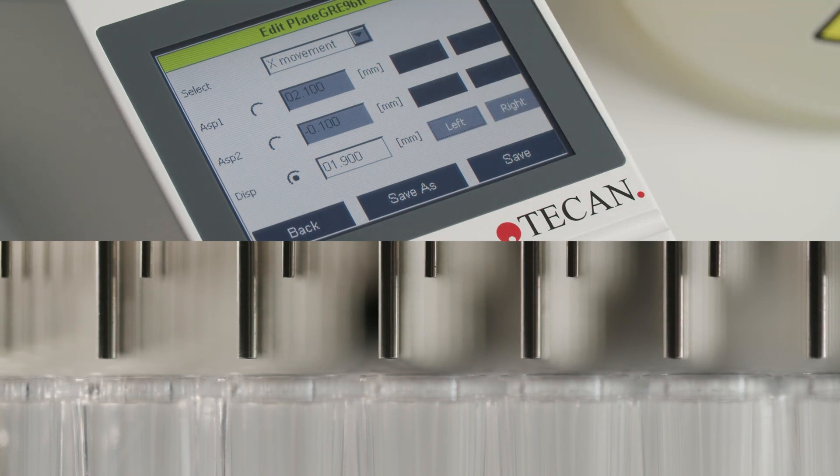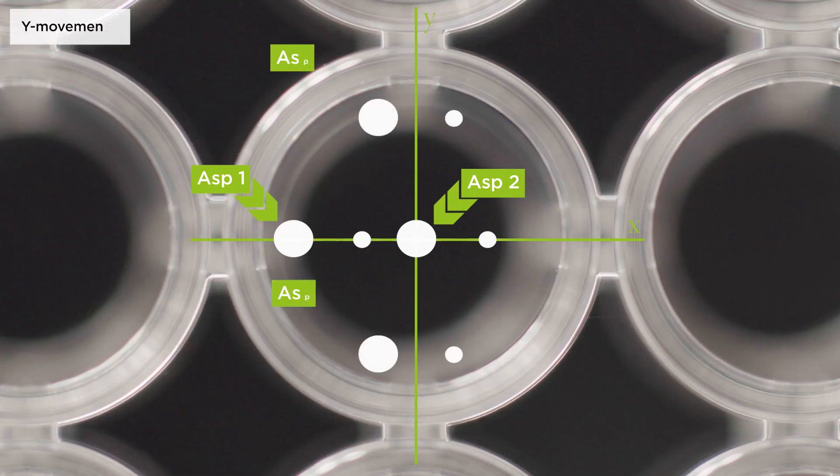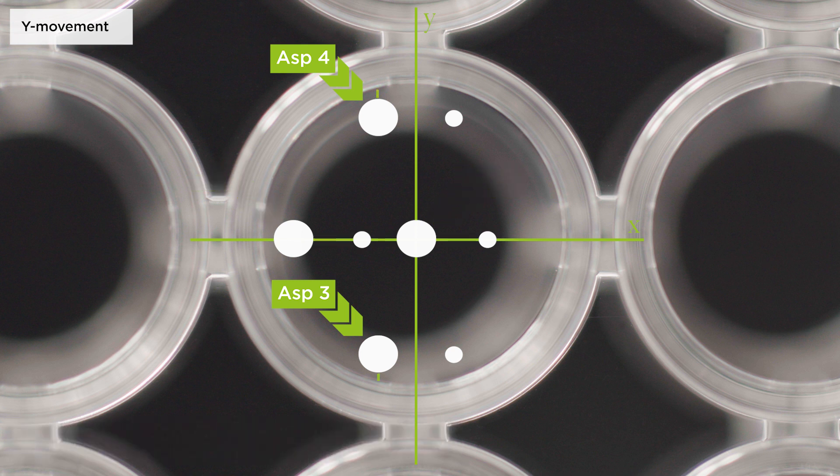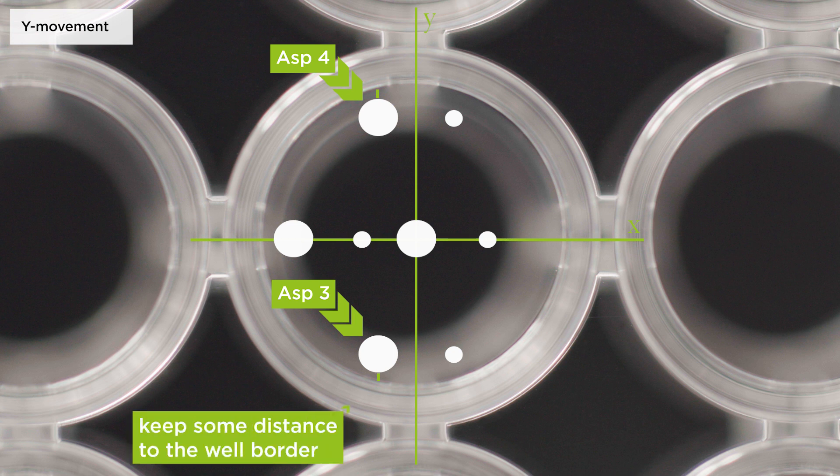If the instrument is equipped with an indexing mechanism, four aspiration positions can be selected when working with a 96 high throughput or a 96 indexing wash head using 96 well microplates. Aspirate three should be set at the front of the well and aspirate four at the back, without touching the walls.